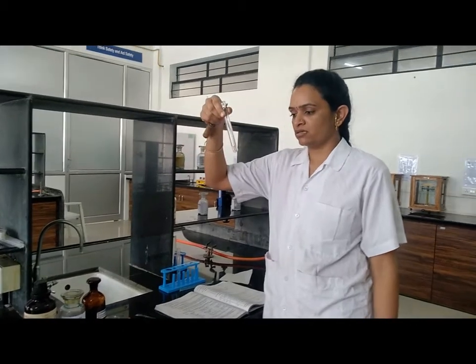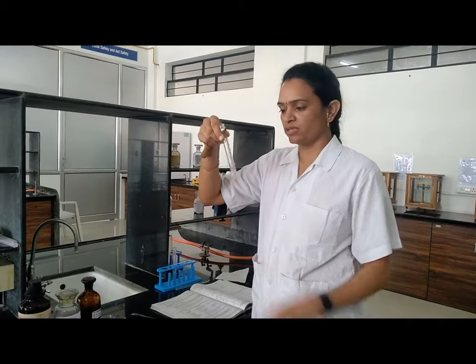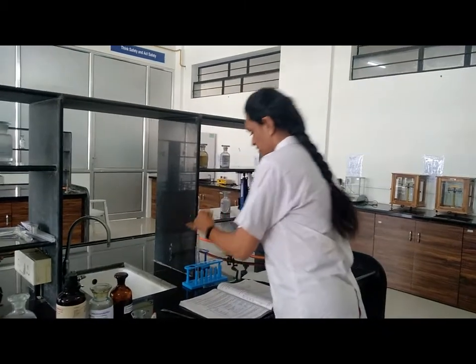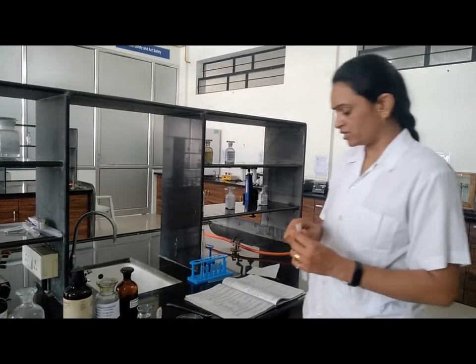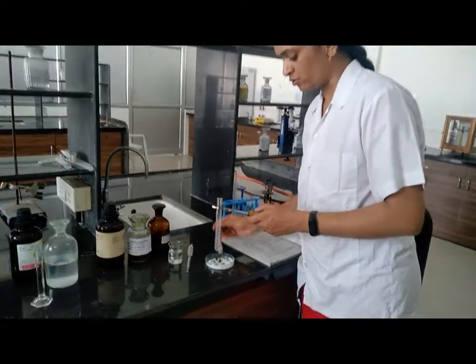Observation is in water aspirin is sparingly soluble. Then second we have to check solubility in alcohol. Again take sample approximately 1 to 2 milligram.